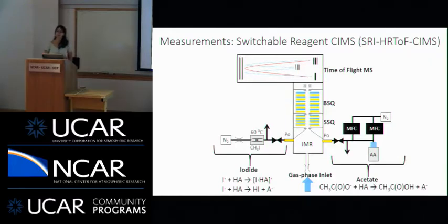So there are a couple of important points here. The first important point is that we have two different reagent ion setups, and we can actually switch them very rapidly. We typically operate by switching for about 5 minutes on I- and 5 minutes on acetate, but we can really run this as fast as we want, although probably no faster than 10 to 30 seconds at our current setup due to pressure fluctuations. But we prefer having a little bit of averaging time. So we're looking at a few minutes in each of these different reagent ions.